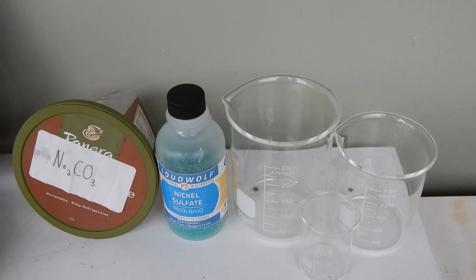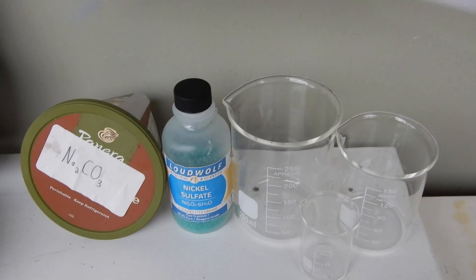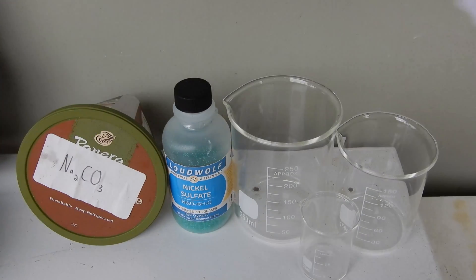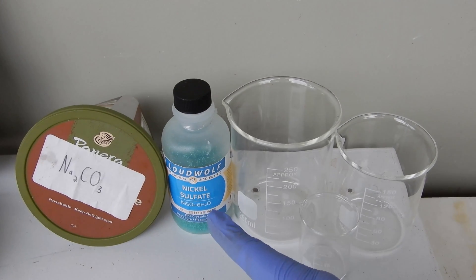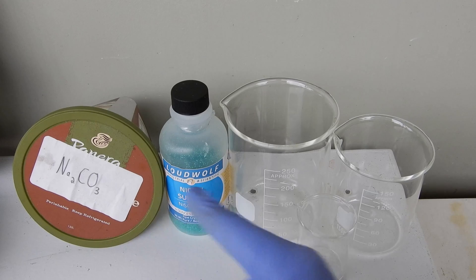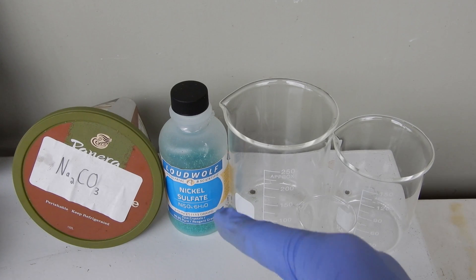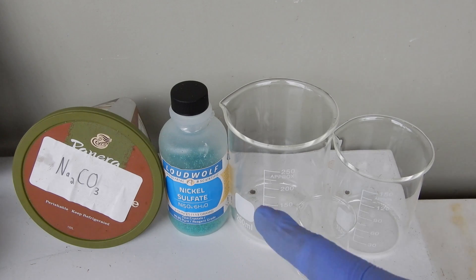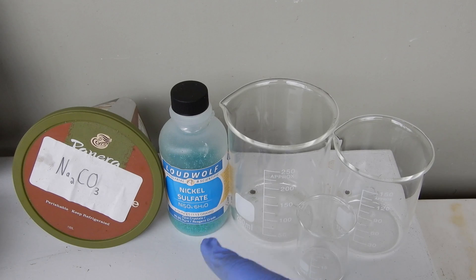Hey everybody, welcome back to Back Maxi. In today's video we're going to be making some nickel oxide thermite, and we're going to do that with some nickel sulfate, sodium carbonate, and aluminum powder. The process is turning the nickel sulfate into nickel carbonate with a double displacement reaction, then decomposing the resulting nickel carbonate into nickel oxide, which we can then mix with aluminum powder to reduce it to nickel metal.